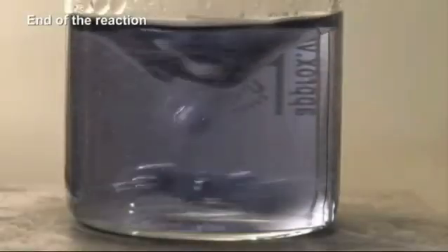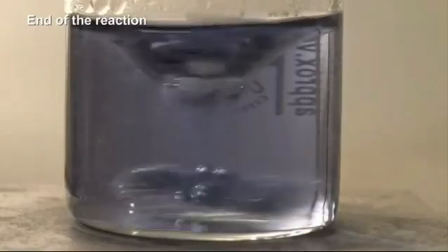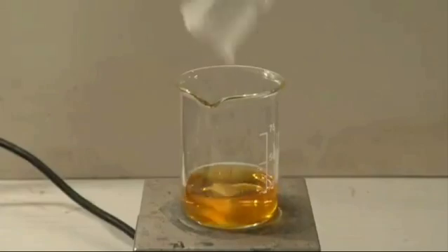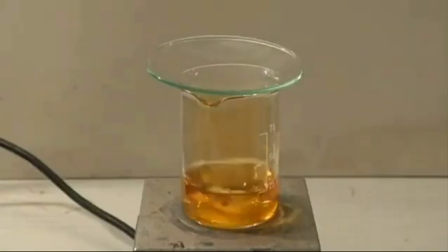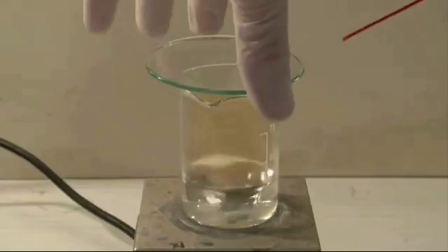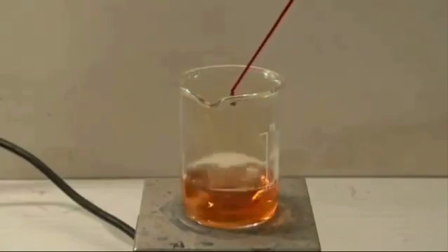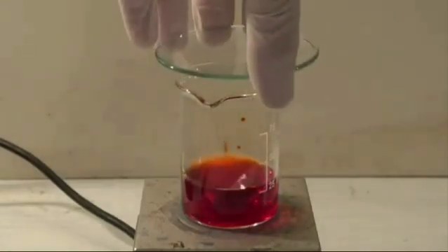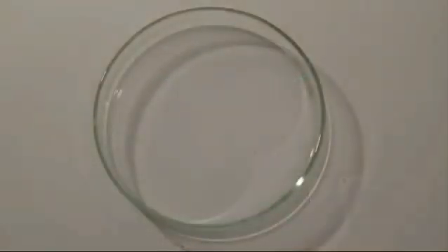The color has now changed and it is firmly mixed. At the end of the reaction, the solution stays blue. Next, a smaller amount of solution was prepared. In this case, 10 milliliters of each solution were mixed. Then ferroin was added and the solution was heated a bit to make the reaction faster.